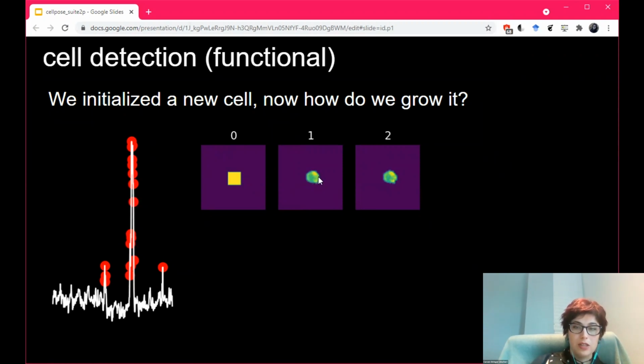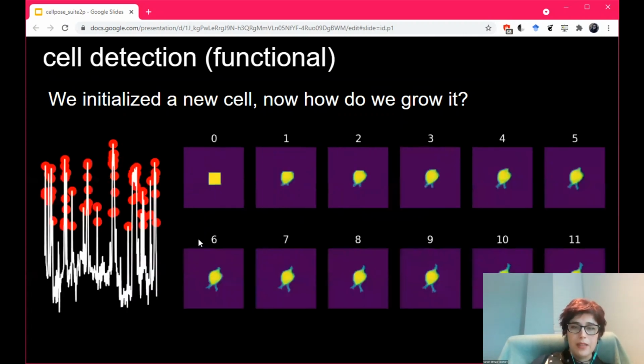In this case, the pixels inside this square were above this threshold, so just these pixels in here were taken, rather than more of these pixels. And so assuming sparsity in the trace means I can come back with a peak that's nearby and extract another cell there that explains other activity that could be overlapping with this cell. So that's why we make this sparse assumption.